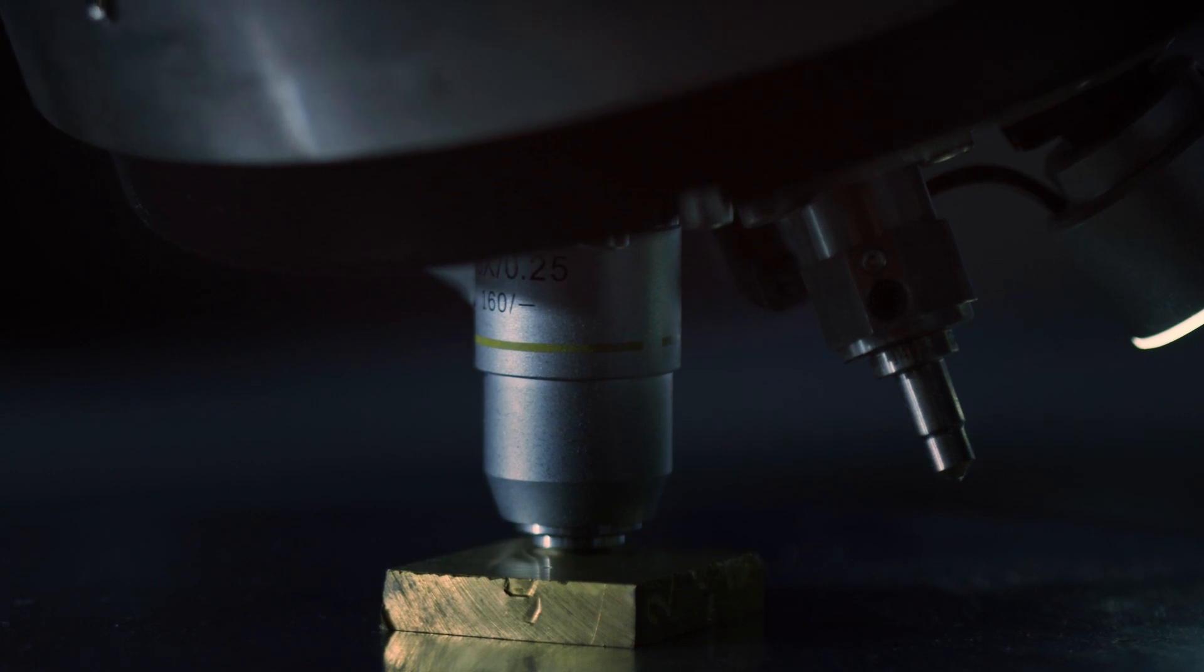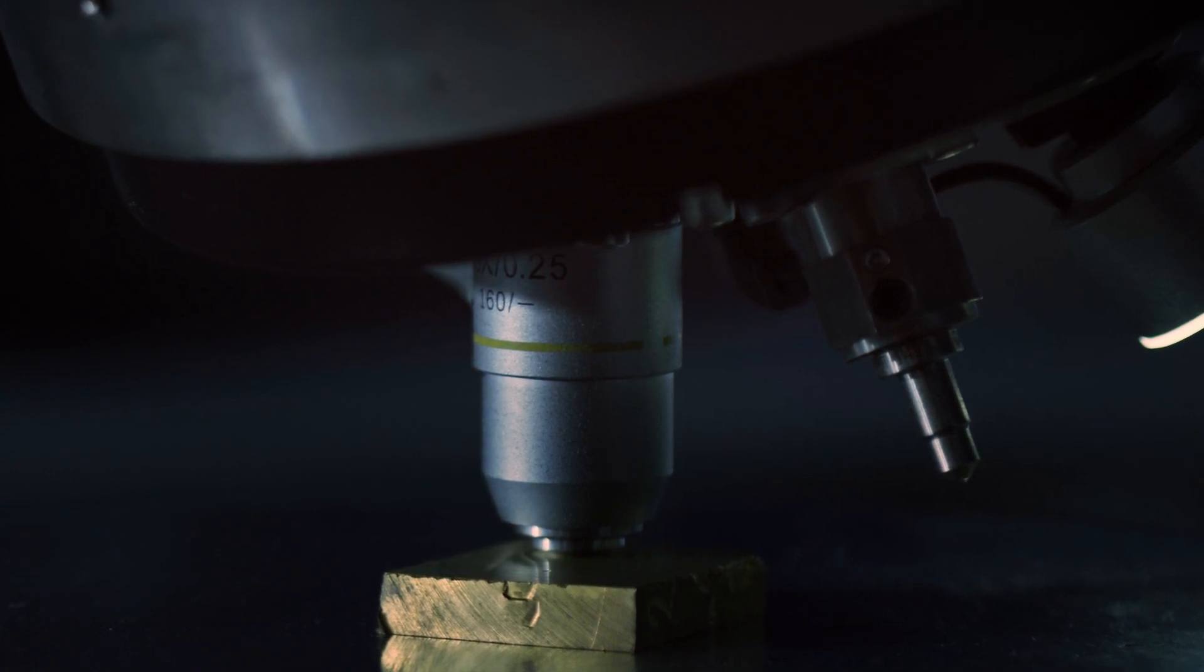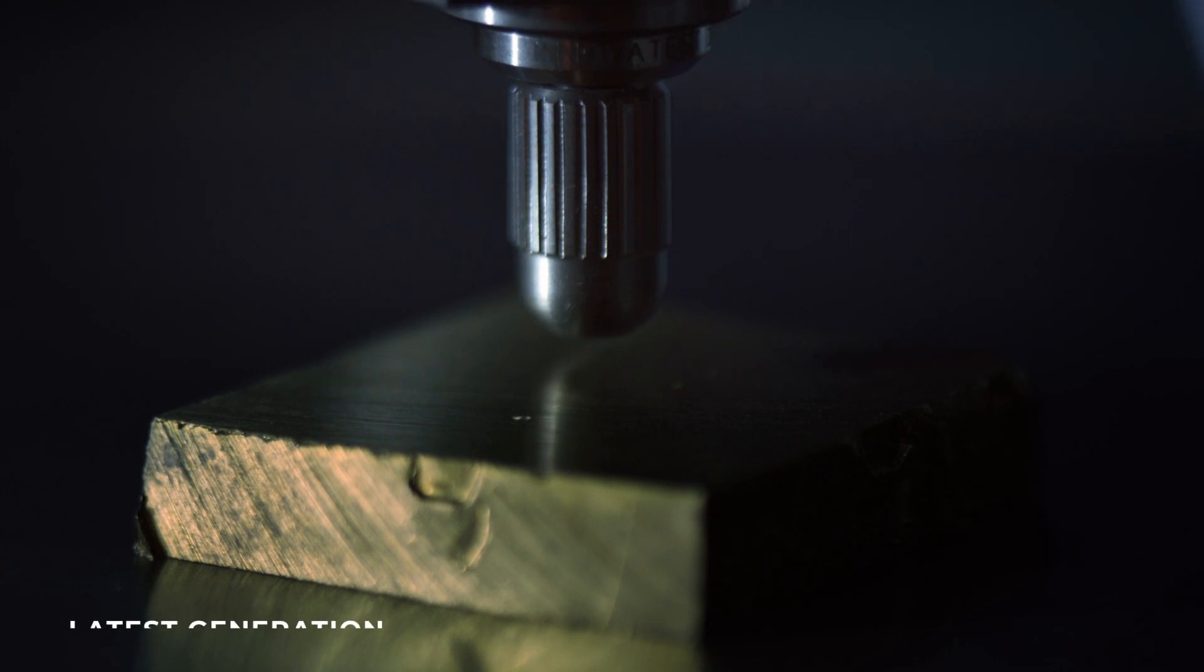Various microscopes, spectrometers, and durometers are just some of the latest generation equipment in our possession.